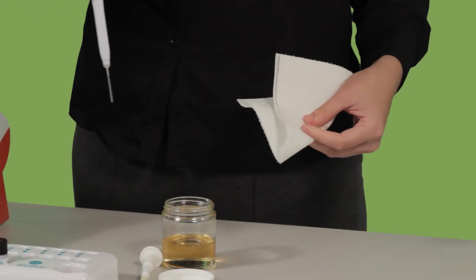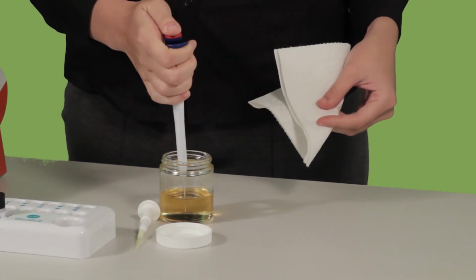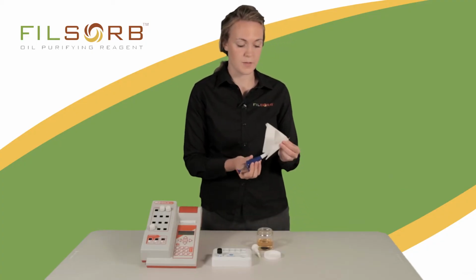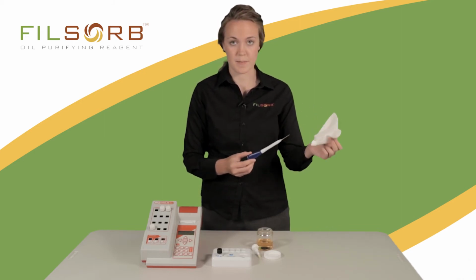When you're ready to take your sample, press the plunger of your pipette all the way down and insert it into the oil. Slowly let it rise and wipe off the tip of your pipette to remove any excess oil. Be sure to not blot the tip of your pipette.